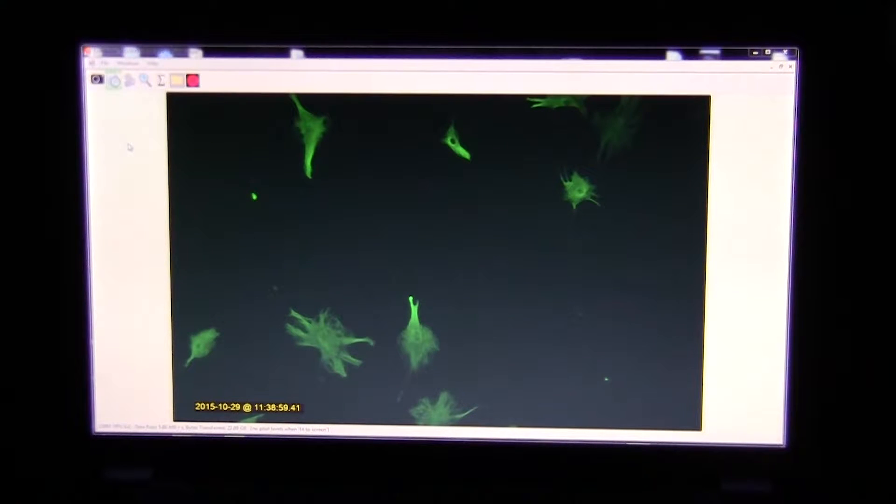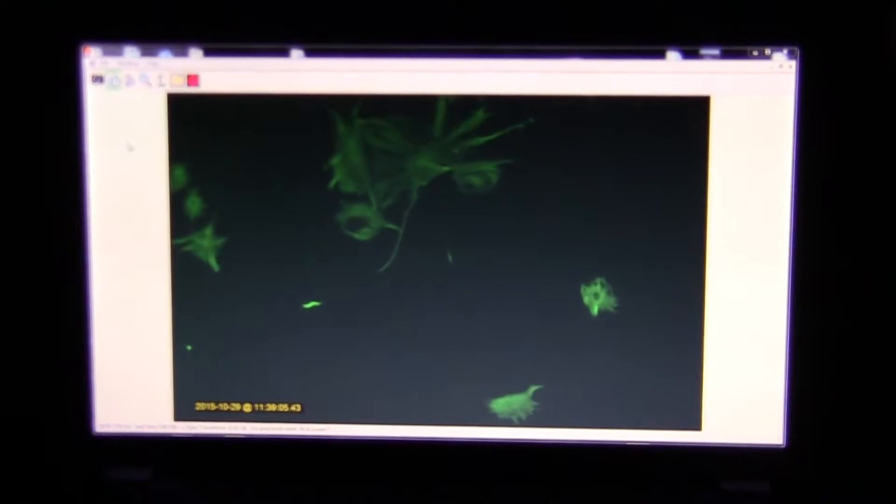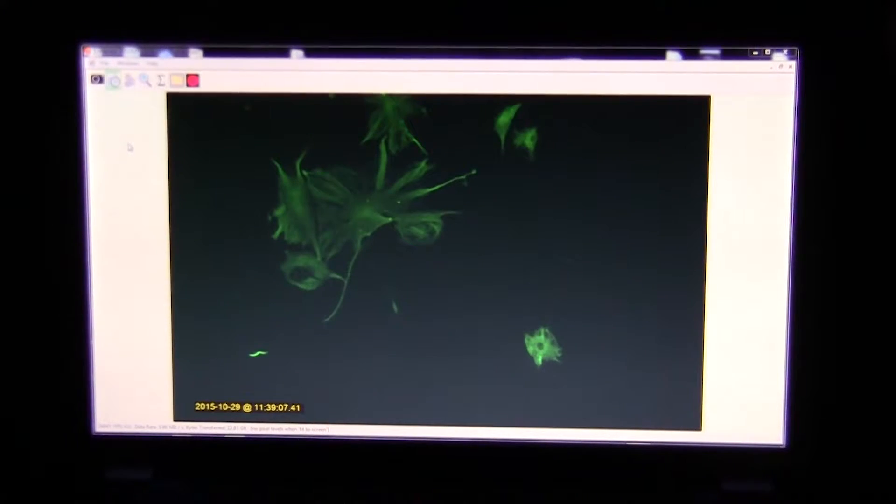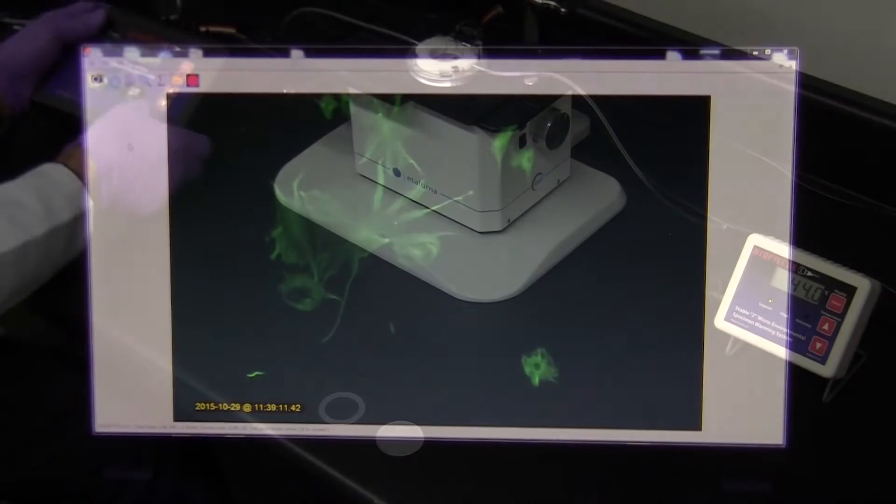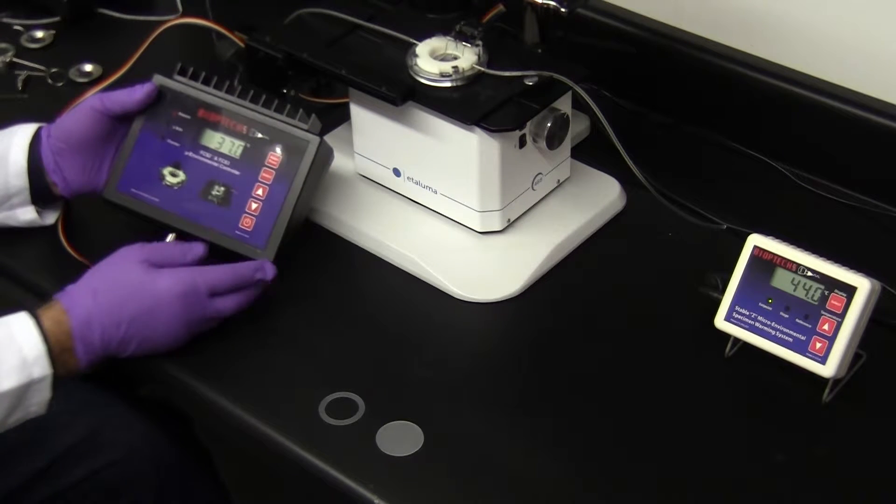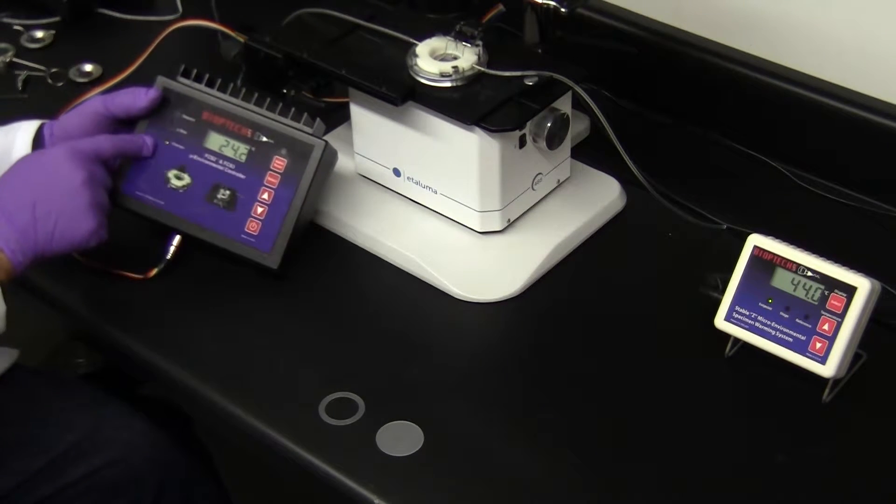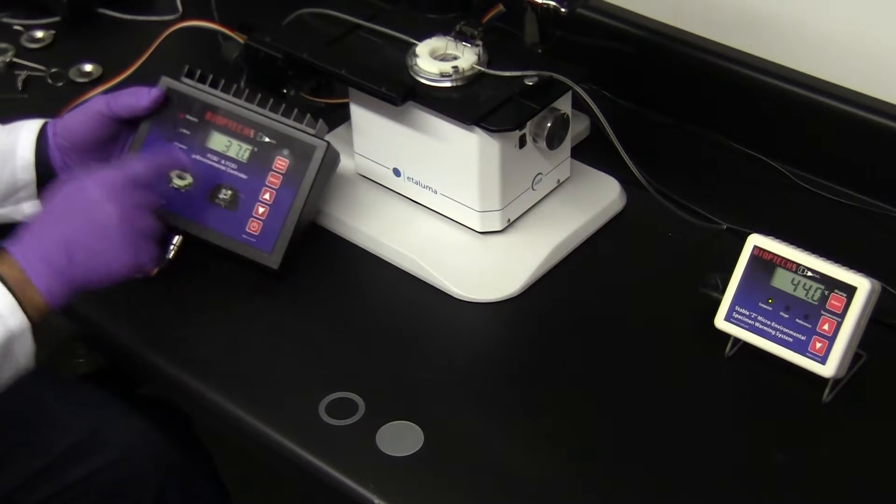The addition of the FCS-2 with its user-definable flow path and uniform temperature control will broaden the scope's utilization for research. The temperature controller is adjustable between ambient and 50 degrees C. It has a fast-acting channel for the microfluidic slide and a second channel for the chamber base.